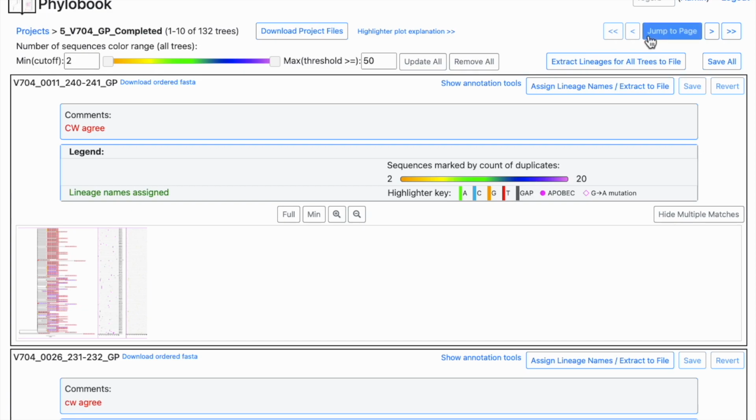So this should feel very familiar to you compared to other types of navigation tools. There's also some admin buttons up here which will allow me to do things like assign users and groups. These admin tools will only appear to you if you are an admin within the system.